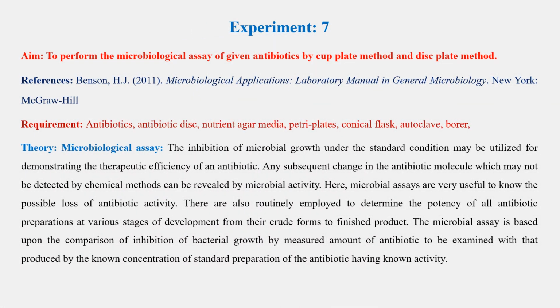This video is about experiment 7, having the aim to perform the microbiological assay of given antibiotics by cup plate method and disc plate method. References. Requirements: antibiotics, antibiotic disc, nutrient agar media, Petri plates, conical flask, autoclave, borer.